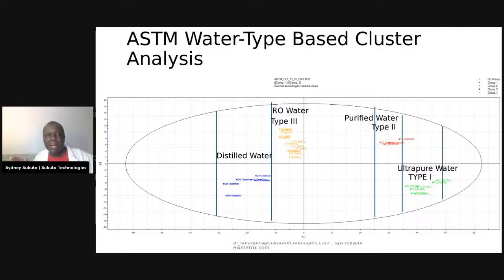Actually, I had another company that was selling water as type 1 and 2, and I didn't want to use it because their samples were overflowing in here. That would create a lot of ambiguity because they mix it. In fact, on their bottle they say type 1 and 2. And when I put it here, it does exactly that.